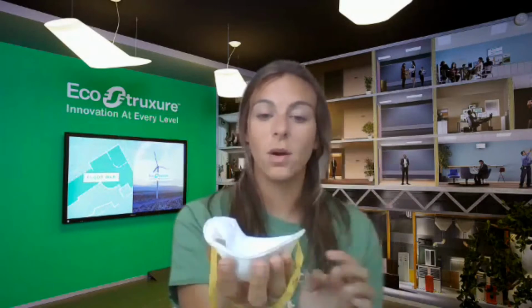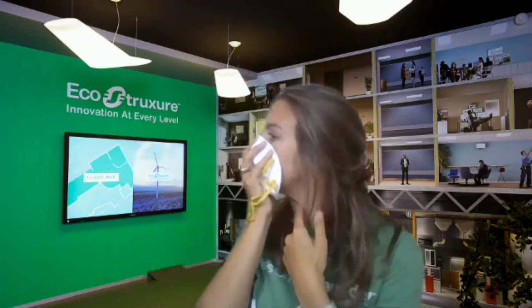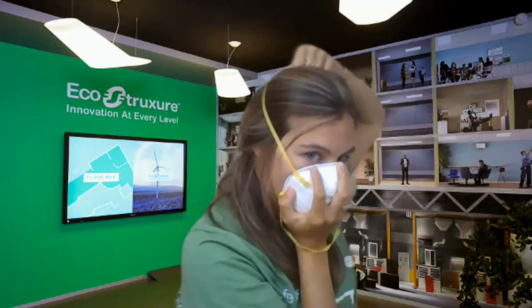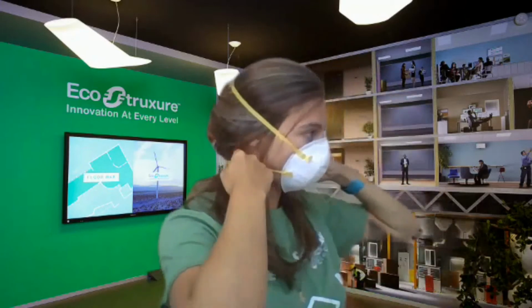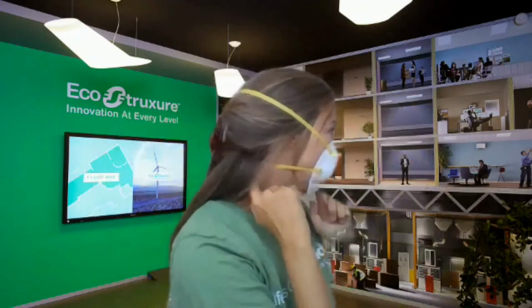We want to make sure that this gray bar is facing away from you, and closest to your body will be the print. Okay, so holding the mask, gray facing away with yellow straps down. We're going to put it in our palm and place directly over our nose, mouth, and chin. Pulling over the first strap, putting it at the crown of your head, and taking the next and placing it over the base of your skull. Now, if you have long hair, it should fit perfectly in the middle, so making sure that's tight along the base of your skull.